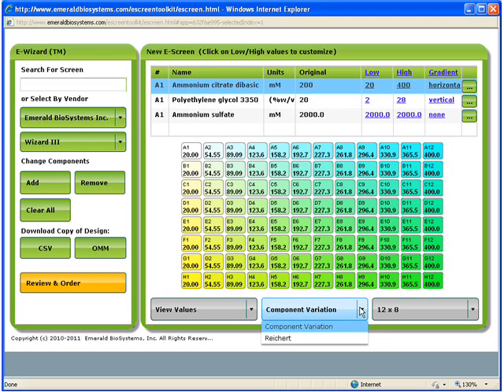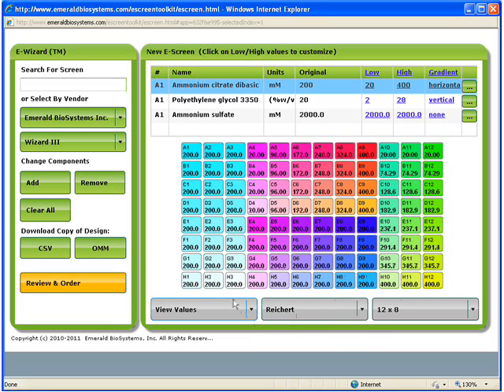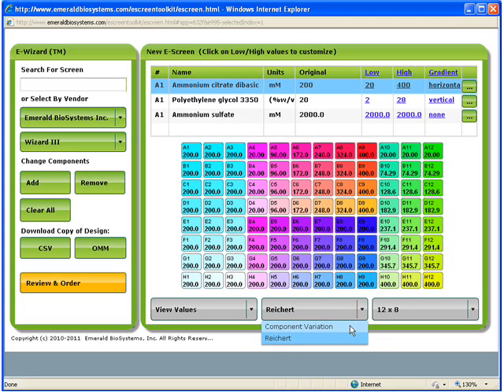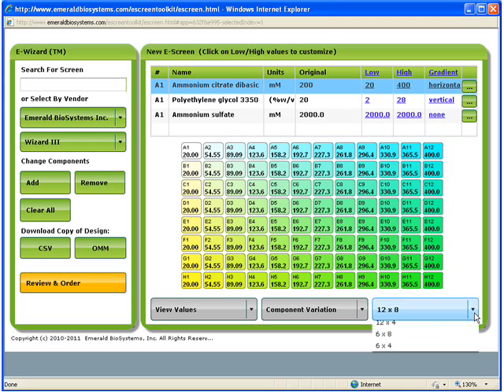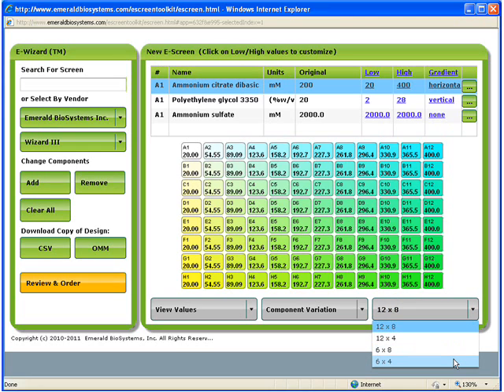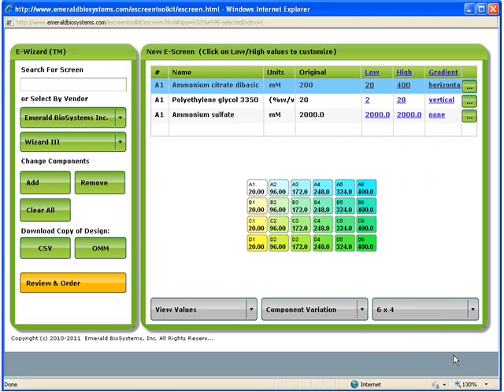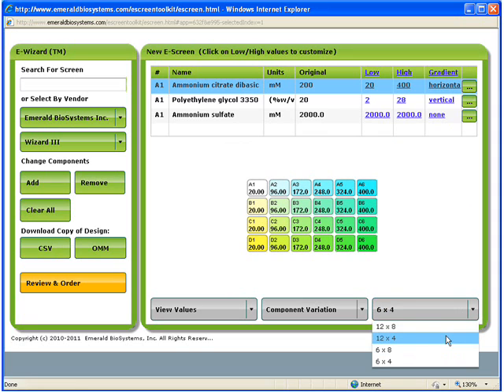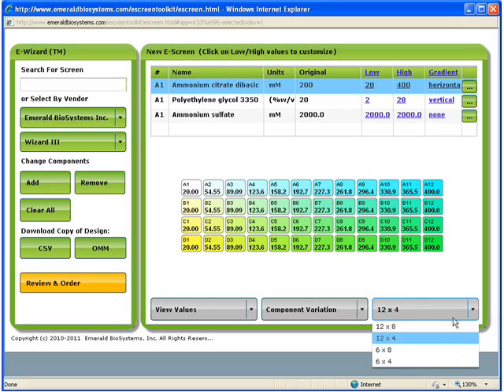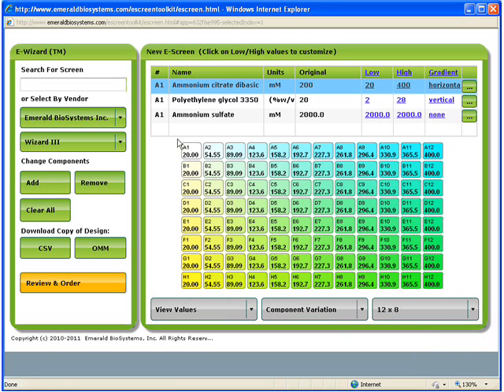There are two standard screen types that can be used with eScreenBuilder. Component variation is what I've chosen for our example, but there is also an option called the Reichardt optimization, which can be done with a three-component screen. The Reichardt optimization automatically creates four quadrants with many optimization screens in each quadrant. In some cases, 96 conditions are more than necessary, so the menu in the lower right allows you to change the number of conditions to produce a 24, 48, or 96 condition screen. For our example, we will stick with our original design in a 96 condition screen.